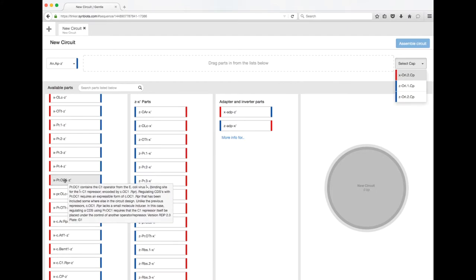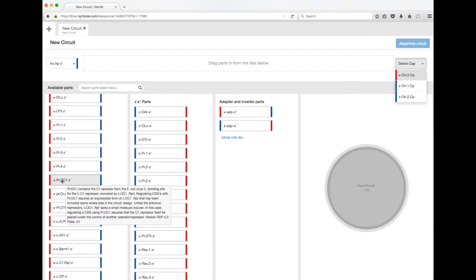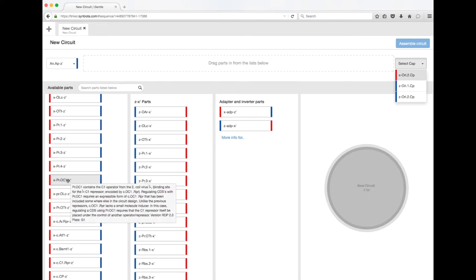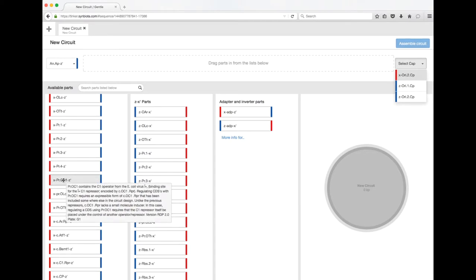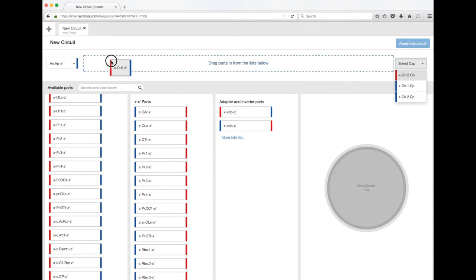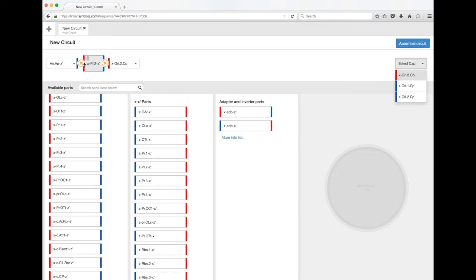You'll also see some promoters with an 'O' designation, for example OC1. This 'O' is called an operator and it allows you to control that promoter with another protein. For example, OC1 is a binding site for what's called the C1 repressor. So if you wanted to control this promoter, you could also express the C1 repressor in a different program and that would bind and prevent this promoter from working under certain conditions. The first thing you always need to add is a promoter — I'm going to choose PR2.